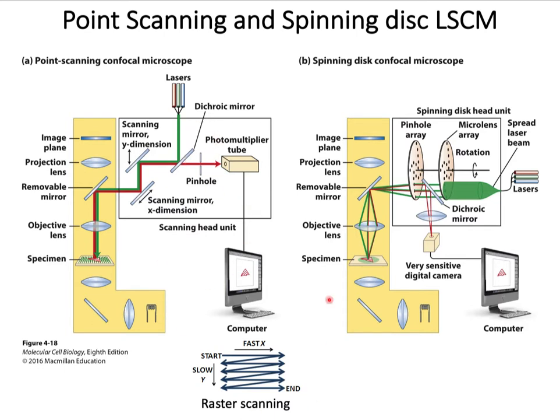Now, thousands of these optical fluorescence data from each and every point that the laser scans will be stored in the computer and merged together to produce a crisp and sharp, typical confocal image. The only drawback of this process is that it is time consuming, as the raster-fashion laser scanning of the entire sample takes some time and cannot capture a fast dynamic event in a cell or a live cell.